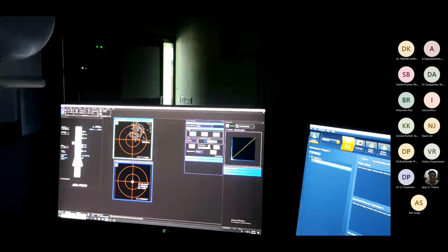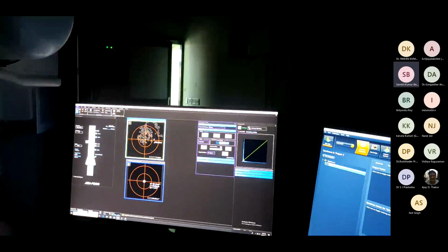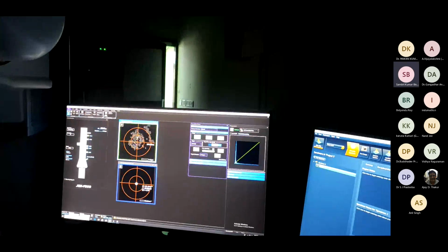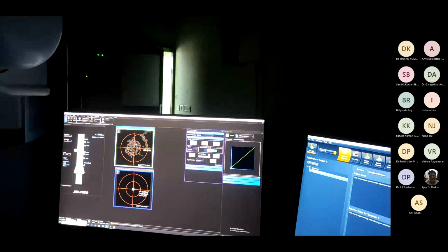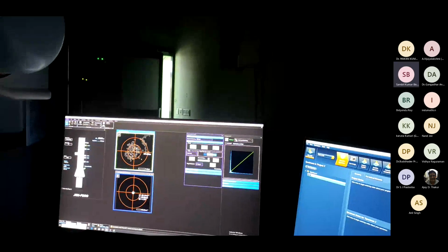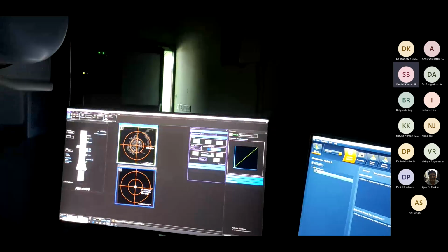Okay, upper screen. Now bring the image to the center by the scrolling button. So this is our sample actually. Adjust the brightness with the gain or offset. So we have to reduce it actually.